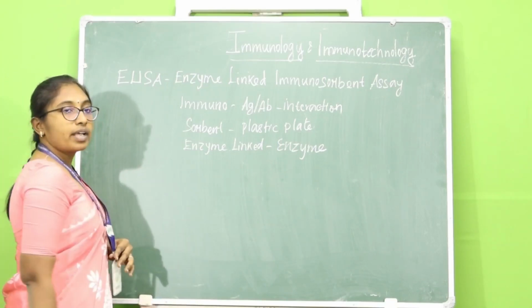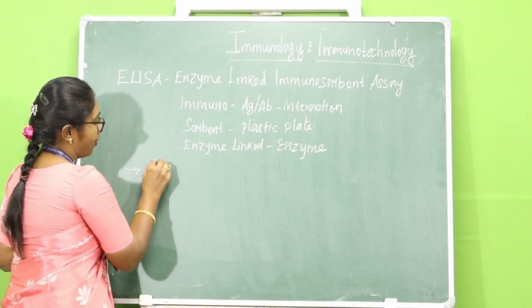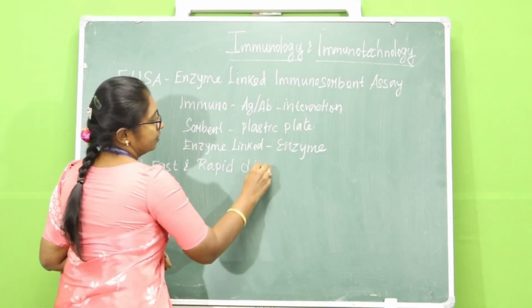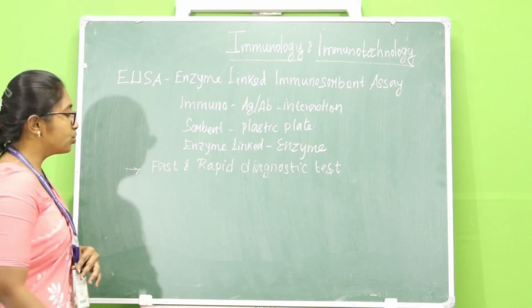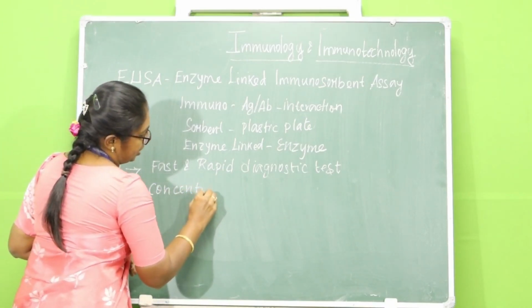So why are we going for enzyme-linked immunosorbent assay? It is a fast and rapid diagnostic test, commonly used to find the concentration of an analyte.